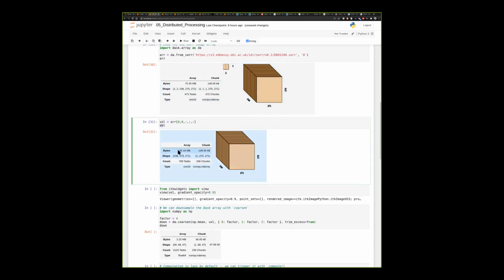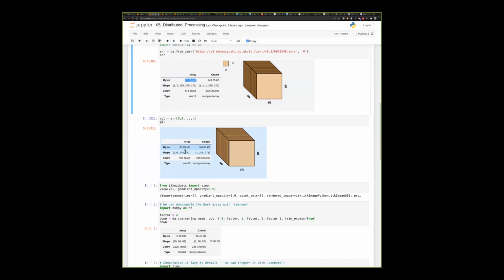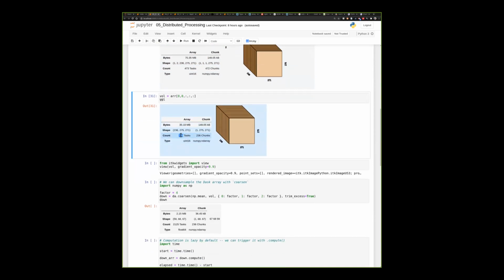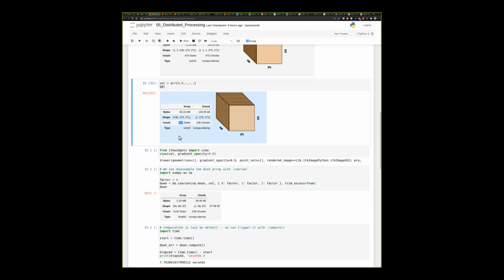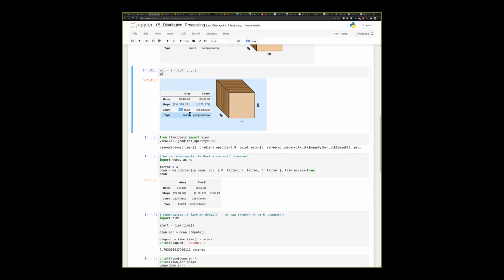Now that volume has half of the original data set, from 2 to 1. There's increased tasks to generate that volume. So we're going to have to just load the data, but then also do some work to extract the single channel. And same other metadata.